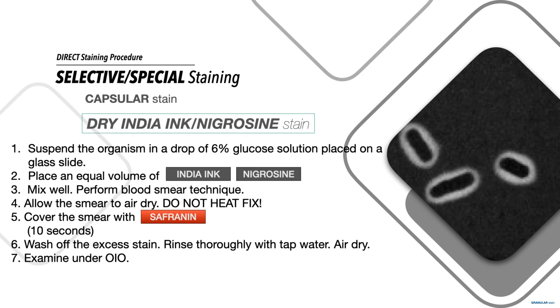Ang nangyayari, your bacteria is not stained. Rather, the stain colors the background black, and it outlines the outer layer, the outline of the capsule.